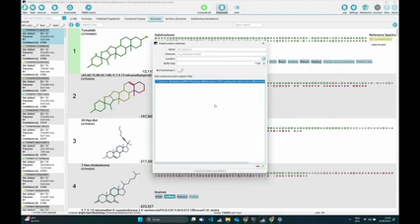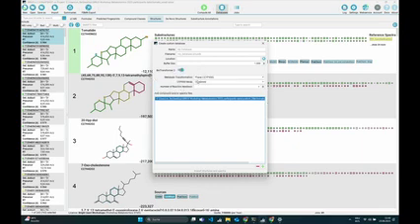So the SMILES string I just showed was from tomatidine. This is quite a boring structure database, especially because we already found tomatidine. But what Markus already explained to you is that you can use BioTransformer 3 now to compute some transformations of the compounds that you have.